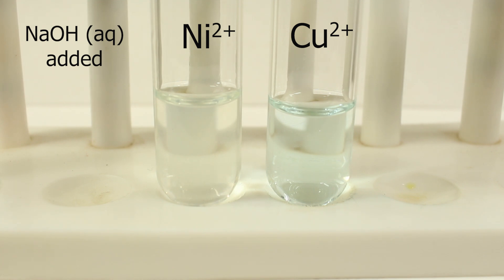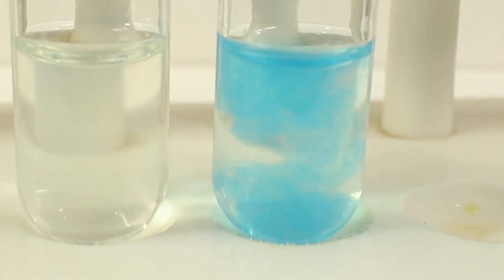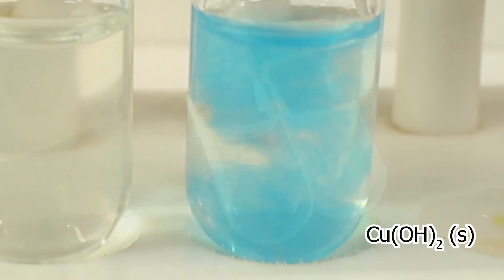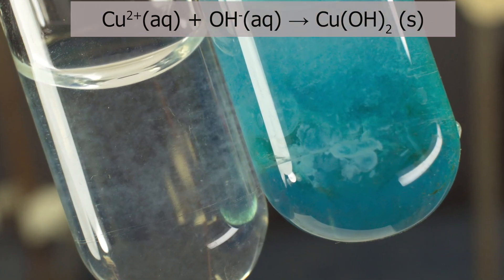Nothing clearly visible in case of nickel. It's white greenish precipitate. But in case of copper II, gelatinous blue precipitate. Positive result for copper ions presence on addition of sodium hydroxide.